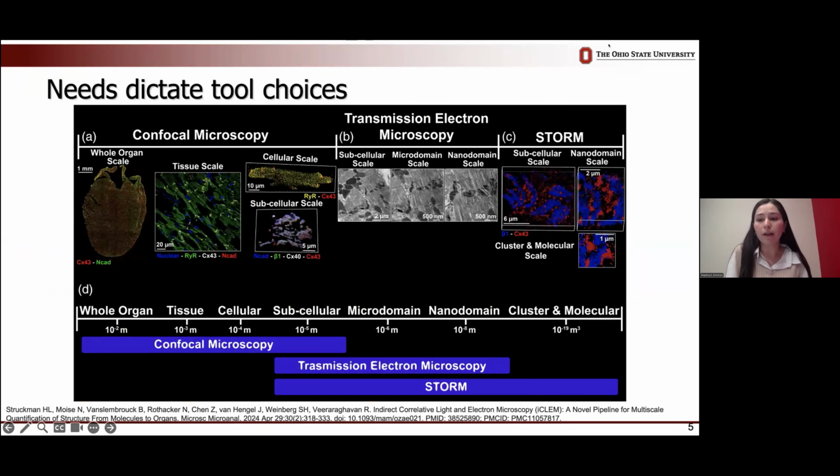The main method our lab likes to use is microscopy. And as we all know, microscopy is a resolution game. We typically like to start off with confocal microscopy, where we're able to fluorescently tag and label various proteins within cardiac tissue, visualize and image them, and then make measurements based on their spatial association with one another. But because confocal microscopy is a diffraction-limited technique, we're still not able to answer all of the questions we have about specific sodium channel localization and the way they cluster.